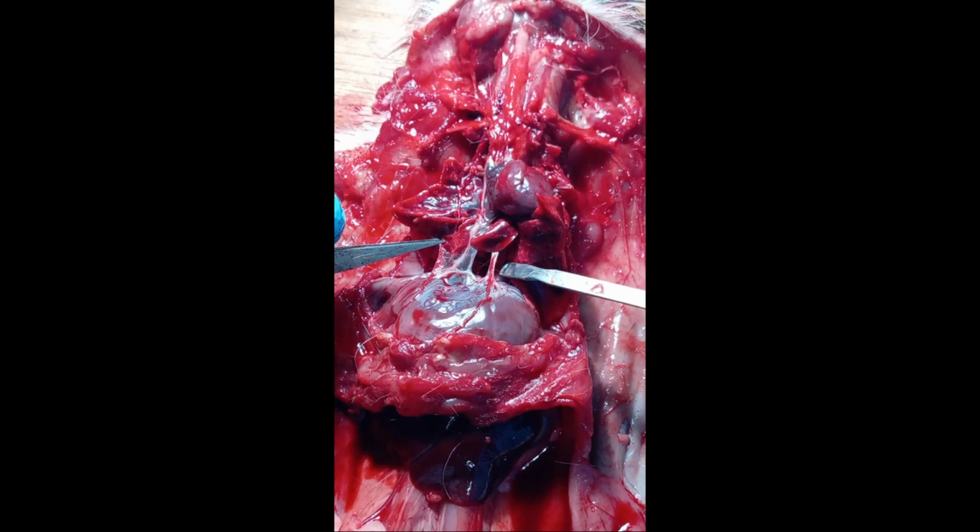Here too, we have the central tendon. This blood vessel is the vena cava. We'll talk about the vena cava and the diaphragm in detail in our next lesson.